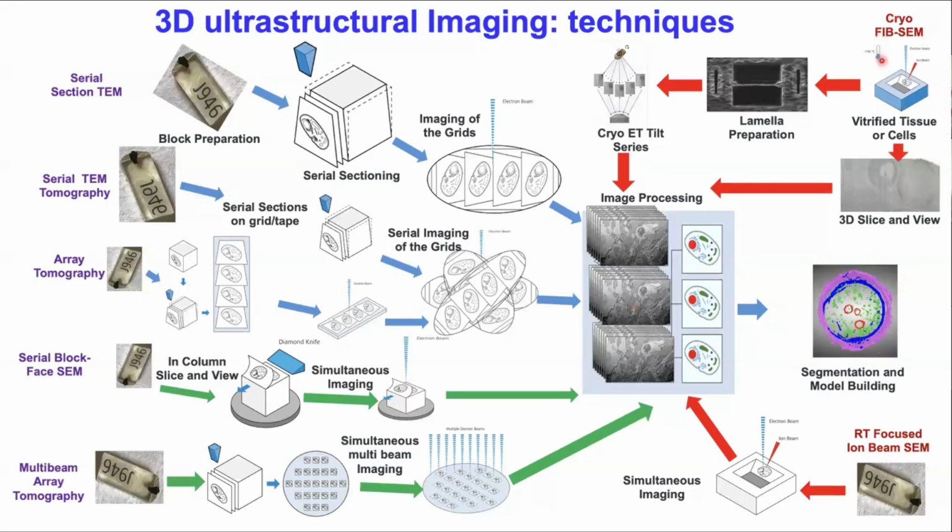But the same, if you are going to use the cryo-FIB-SEM, then you can prepare the lamella. I'm going to focus much more on these aspects, how to do this, and after the lamella, you're going to take the cryo tilt series and generate multiple tilt series. After segmentation, you're going to build your image or model.